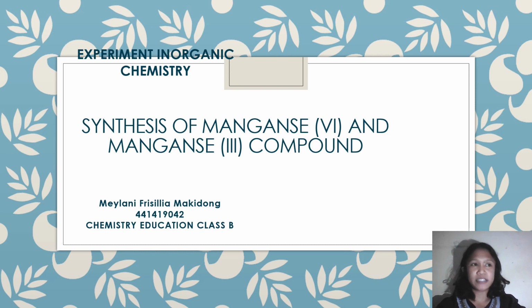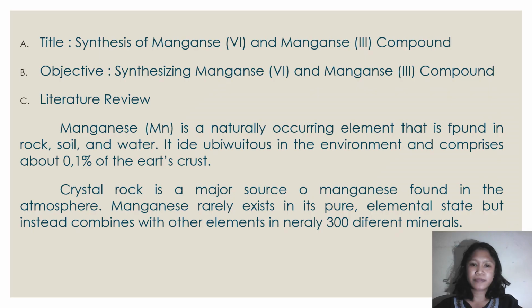Now I will present the result of our practicum about the synthesis of manganese 6 and manganese 3 compounds. The title is Synthesis of Mangan 6 and Mangan 3 Compounds. The objective is to synthesize mangan 6 and mangan 3 compounds.